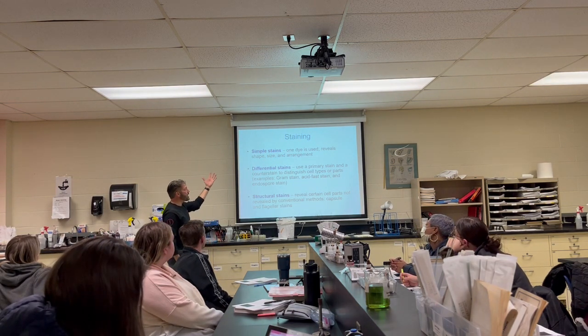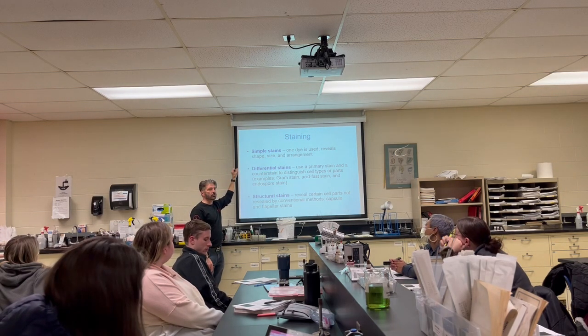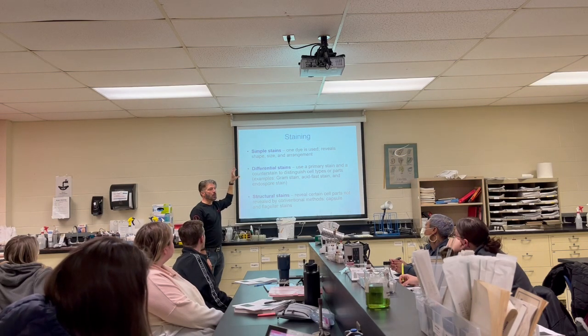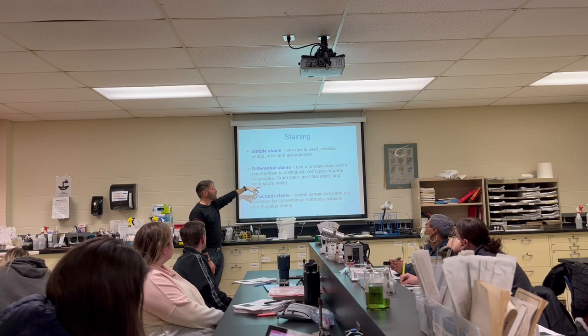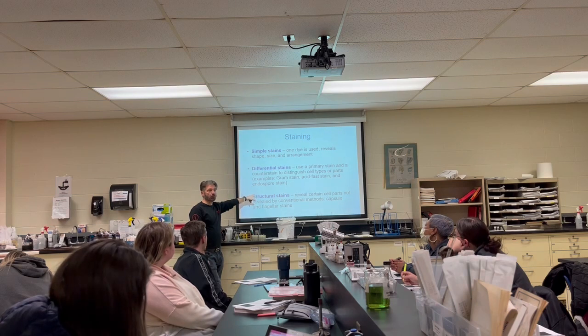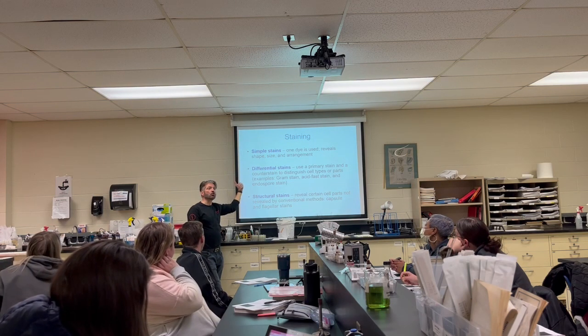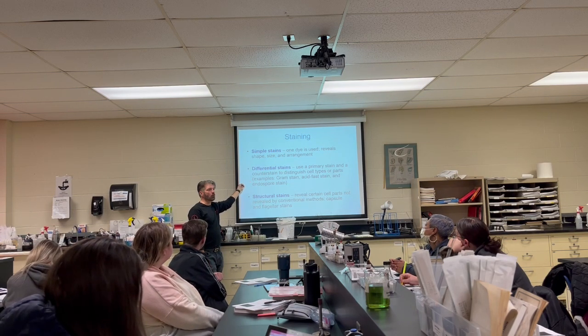Now, for here, we're going to be using differential stains. So that means I can differentiate between certain bacteria. A little bit more complicated, but a lot more information. Right, so if I want to diagnose something or figure out how I want to treat it, if I know whether it's gram positive or gram negative, all right, acid fast or endospore staining. Now, last week, I talked about Lysol, and I said it kills 99.9% of everything, but what's left? Endospores. So, if you were treating an infection and you knew that it had spores, right, would you at least assume or agree that it might be more difficult to treat?